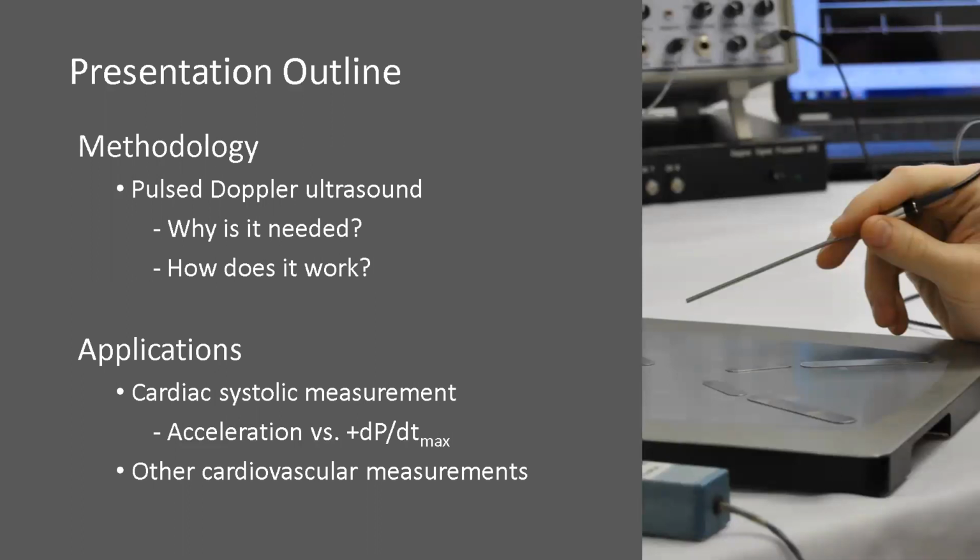I will briefly talk about the why and how of Doppler methods and lead into application studies. Essentially, the acceleration will be the main focus of this presentation. And then I'll briefly discuss other cardiovascular measurements.